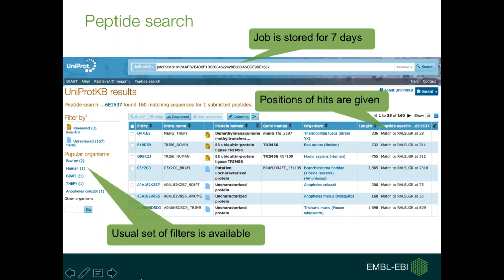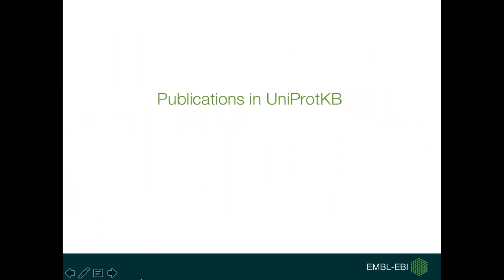Once a search is run, you're presented with the usual tabular view of results, as is common to all searches run on UniProt.org. All searches are provided with a unique job identifier, which allows you to retrieve and come back to those results up to seven days later. The positions of the hits onto each sequence are provided, and the usual set of filters available for all UniProt searches is available here as well. Data can also be downloaded and customized before download, so that you can tailor the data you actually need for your further research.